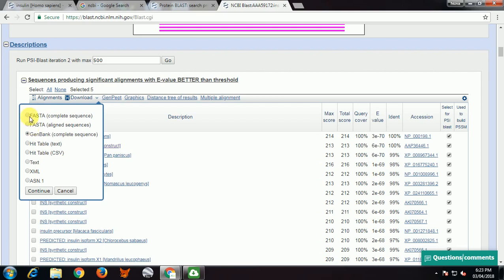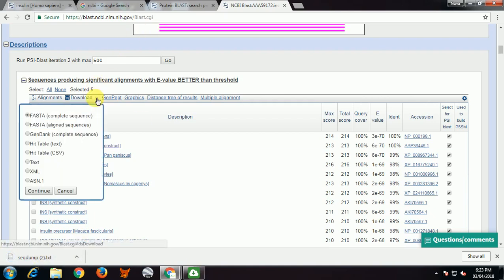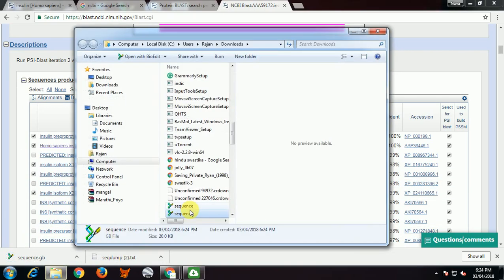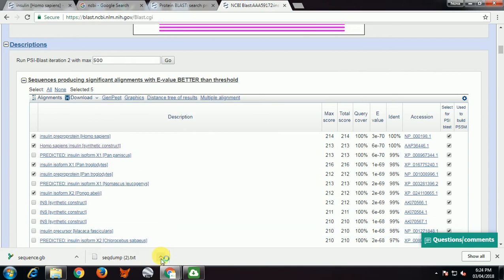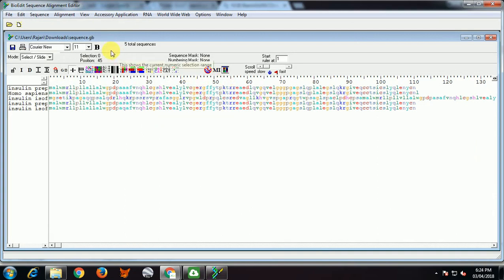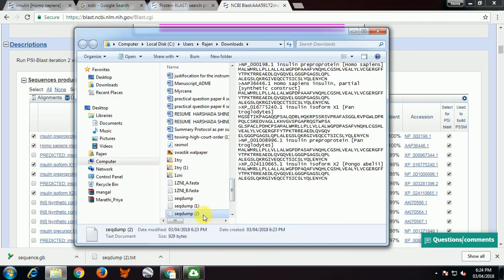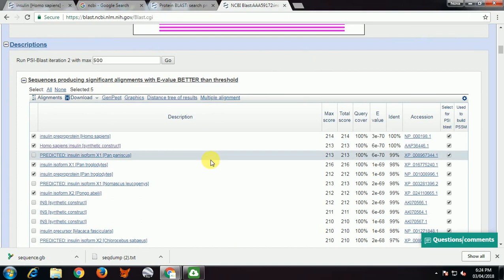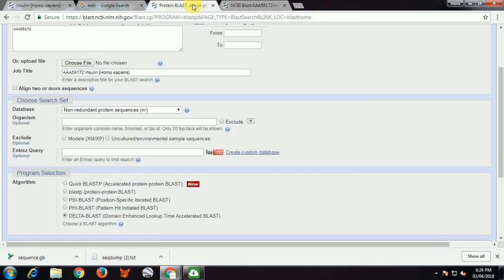If you want to download the alignment, select the sequences by clicking in the boxes and click on download. You can download FASTA complete sequence, aligned sequence, GenBank sequence — whatever you want. Click continue and it gets downloaded as a .txt file. For GenBank sequence, click continue and it downloads in .gb format, which will open in a software already loaded on your computer.